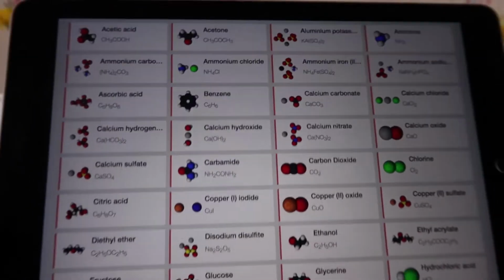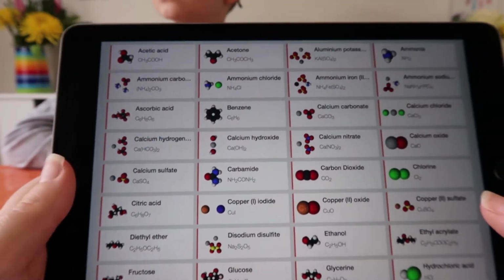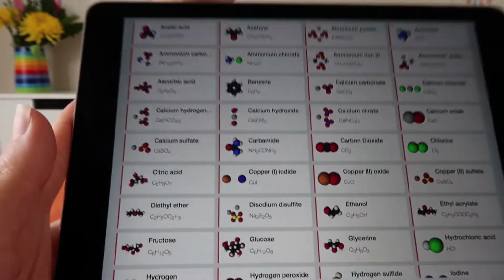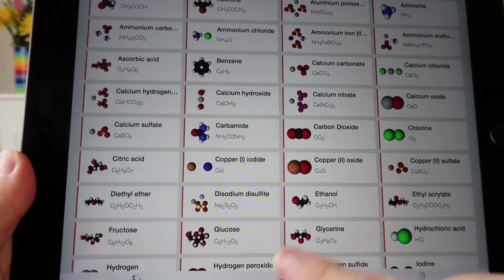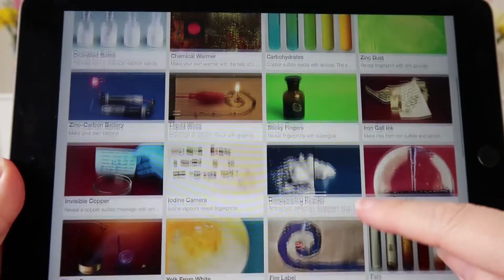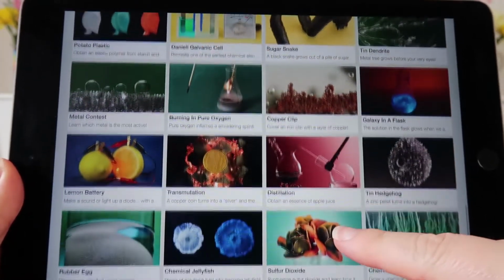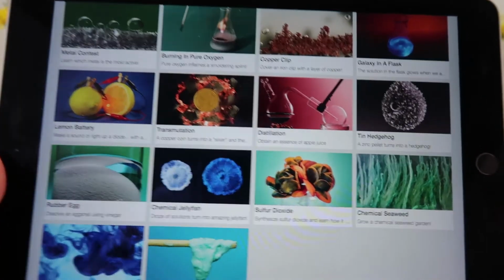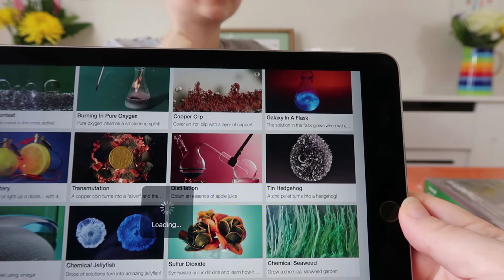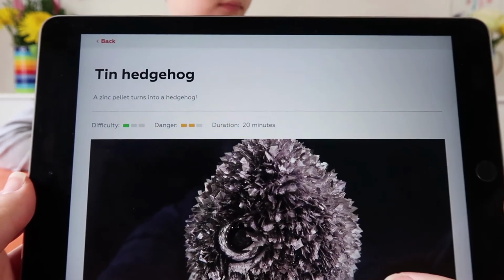I don't know whether we mentioned before, but there is also a MELScience app. So you've got all of the different reagents here. And then there's an experiments tab where it gives you more details about all the experiments. So if we try and find the one for tin, hedgehog, I think that's the one, isn't it? A zinc pellet turns into a hedgehog. Okay, so if we load that up, tin hedgehog.